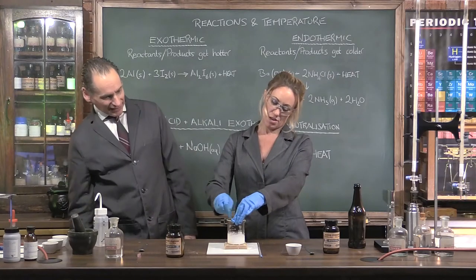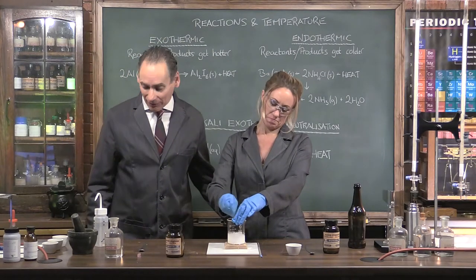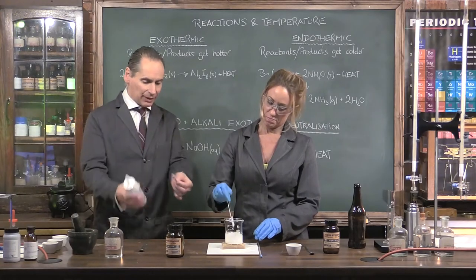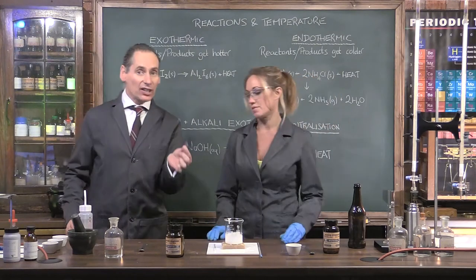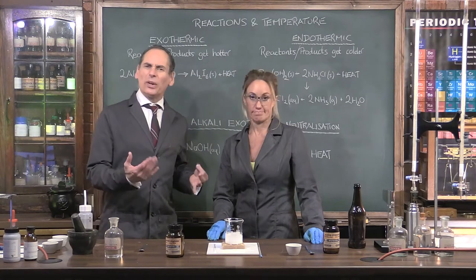It's turned into mush. It's like an unusual looking milk. I shouldn't go drinking it, though. That's right. No, I am going to find my little bit of litmus here. I'm going to put some water on it, a bit of damp. And now hold it over there, and oh goodness, yes, that has gone blue. Tends to suggest that we've got ammonia there. We can smell it a little bit.